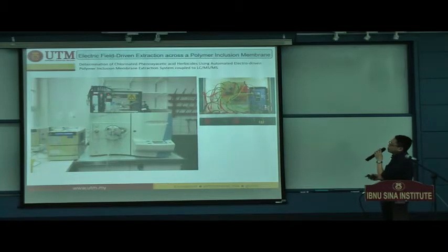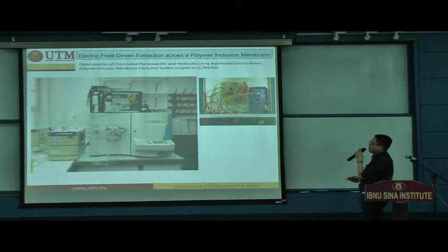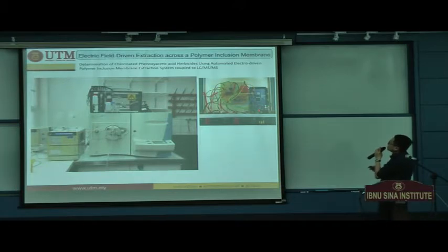The extraction module is on the top. This is a benchtop LCQ Deca ion trap mass spec. So you can see there is a tube over here going directly into the injector, which is where we flow the acceptor solution into the sample injector, and this is our Dionex LC system. And look at this controller box, which we built ourselves. It contains an Arduino microcontroller chip, which connects directly by USB to your laptop.